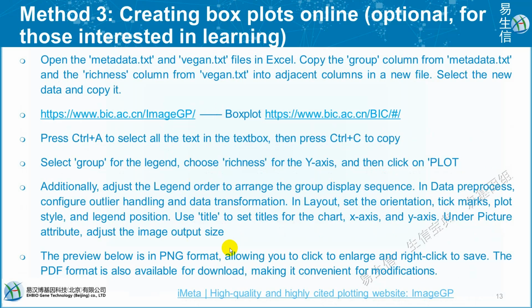Method three is to create a box plot online by using the link given here. Now that I have explained the three methods, we're going to practice them in RStudio. Let's start.